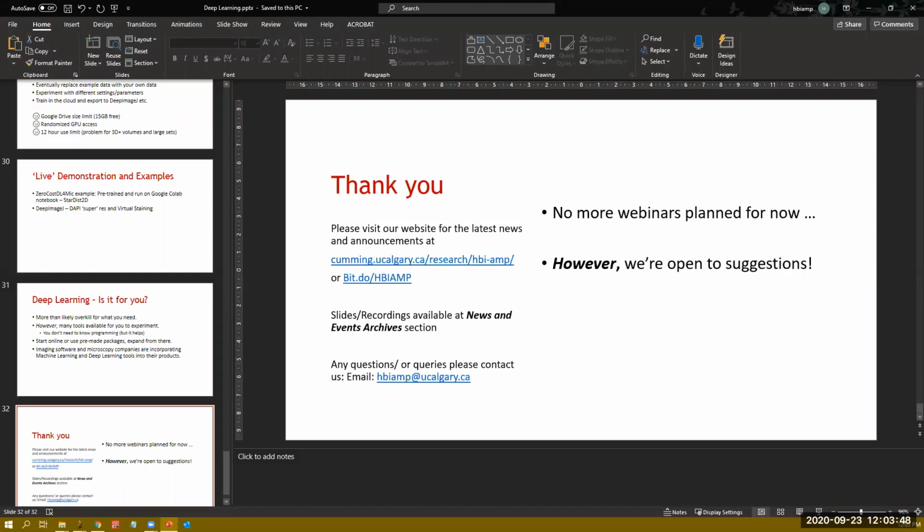So it's a little bit subjective to say if one is better than the other. Deep learning has the potential to be the best, obviously. And the best way to get the best out of deep learning is to train a lot of data with your own data. Even though transfer learning is out there, you can try that first, but it all depends on how well you build that model. And the results will speak for themselves, really.